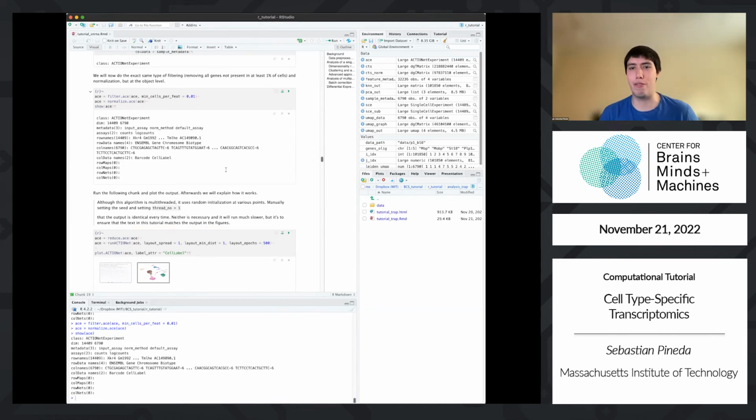So there's a lot of information that isn't informative. So what we're going to do is we're going to remove that component of the data, the mean expression profile that is consistent across everything. And what that's going to do is it's going to amplify the things that actually define cell type specificity. It's going to amplify the signal of the genes that are actually associated with cell type identity or with disease or with cell state, whatever.